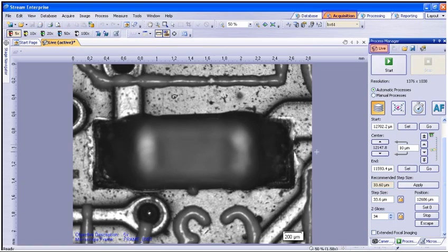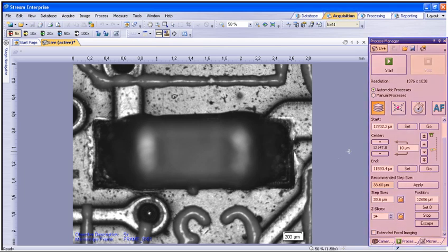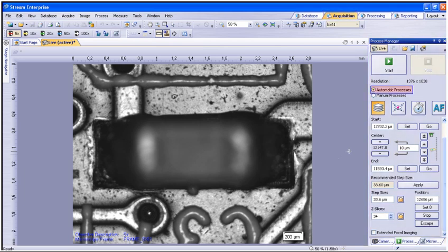To begin, you will need to have a live image within the Acquisition tab and interface with the Process Manager tool window. You will need to select automatic processes.